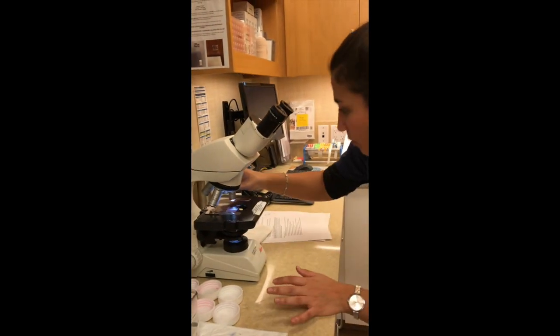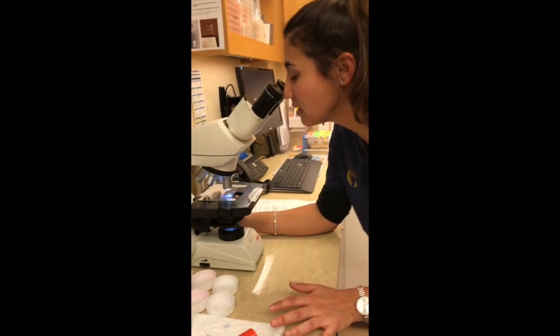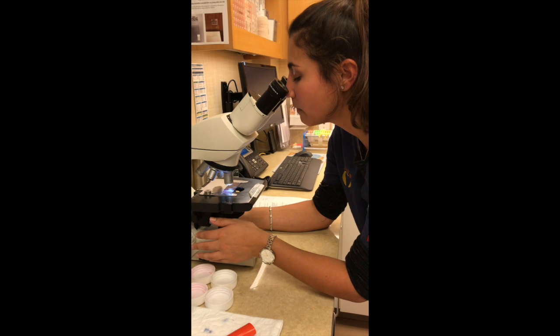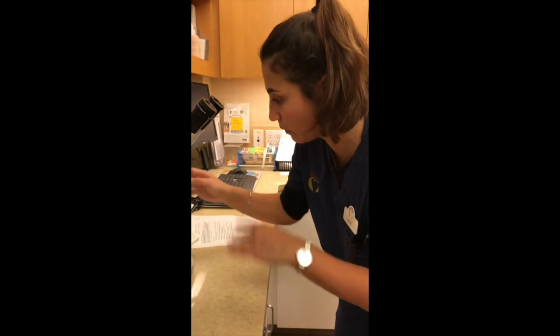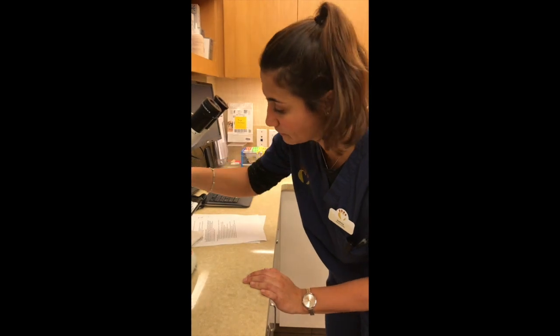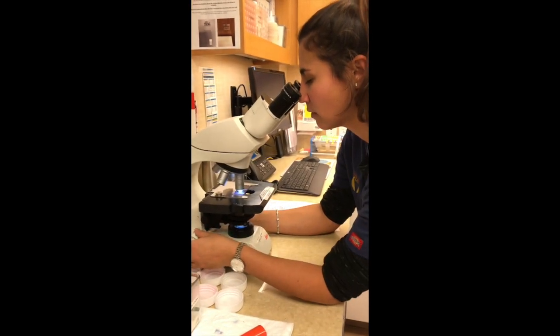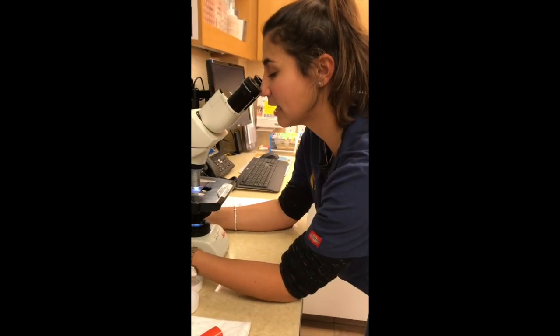Good. Now I'm going to move it to our higher plane, 10 times focus. Perfect. It looks nice and clear. So now I'm okay to move it one more to our 40. Now I'm going to use the coarse knob just to move it to get a clearer view.